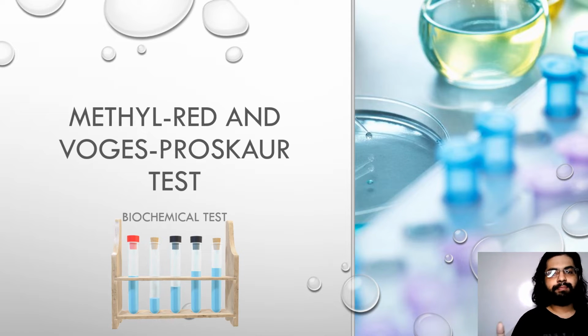Now let me give you a brief introduction to this test. During glucose fermentation, we all know the end results of fermentation are acids and alcohol. Carbon dioxide is also there.